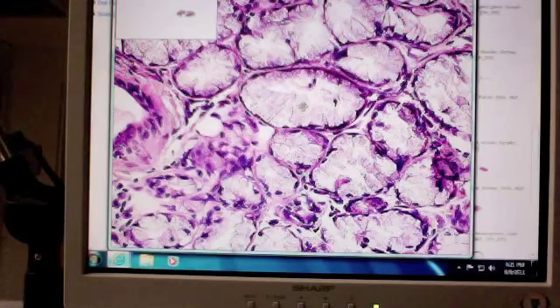Did we say secretory unit? Secretory unit is correct. Okay. And if I put an A over here, and then I put a B over here, and I said the B is sitting in what portion of the gland? Stroma. Stroma. Okay. And A? Parenchyma. Parenchyma.